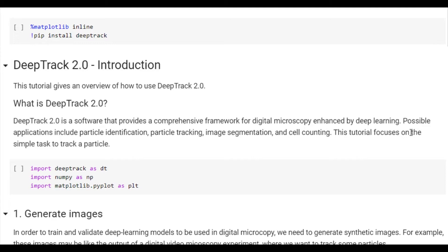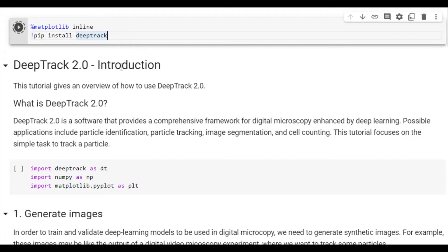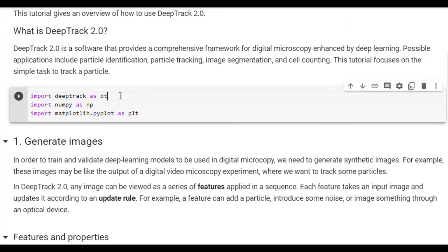We'll start by installing DeepTrack to the local environment. This will install DeepTrack as well as TensorFlow and TensorFlow add-ons. We'll import DeepTrack under the abbreviation DT. We'll also import NumPy and Matplotlib, which are used for mathematical operations and plotting.